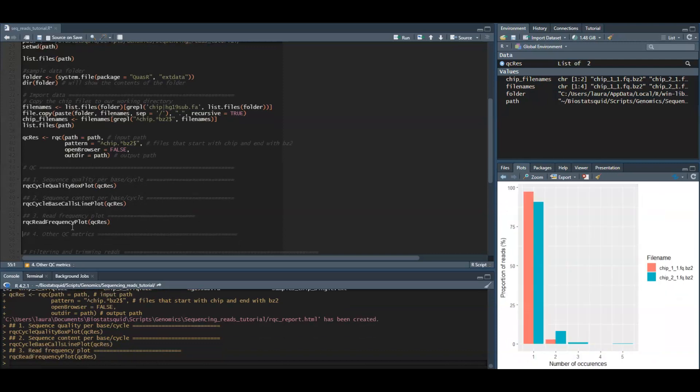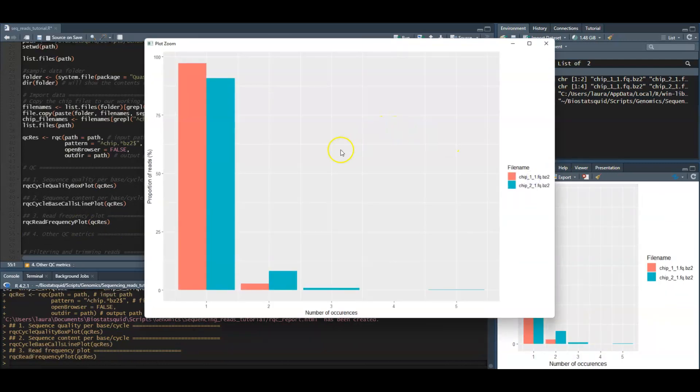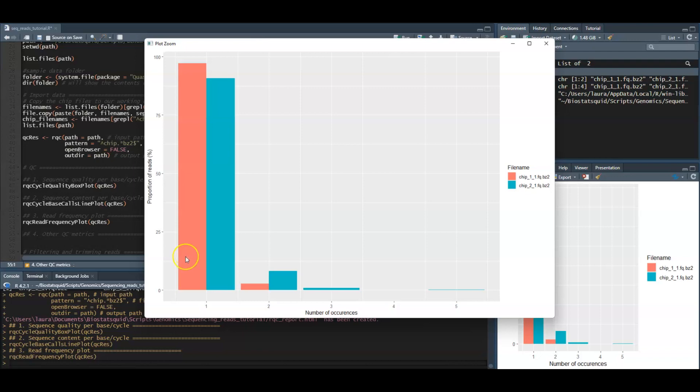However in chromatin immunoprecipitation-seq experiments, duplicated reads are more likely due to PCR bias.